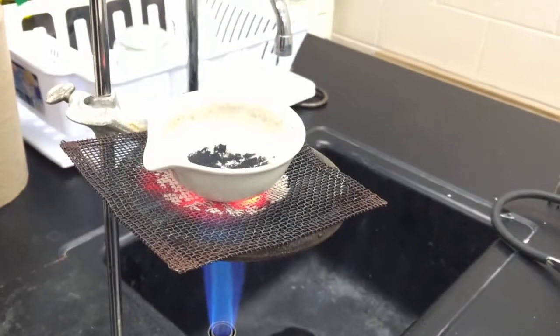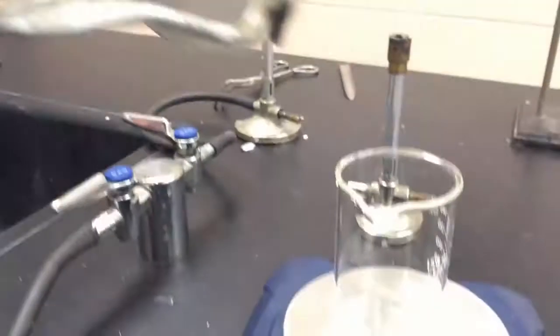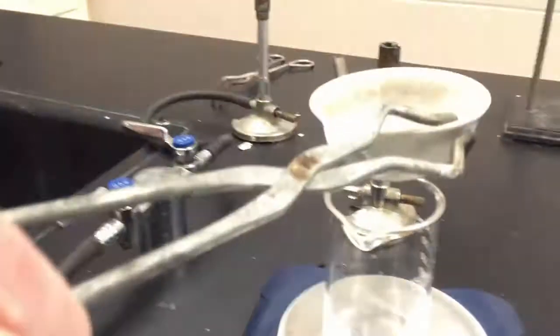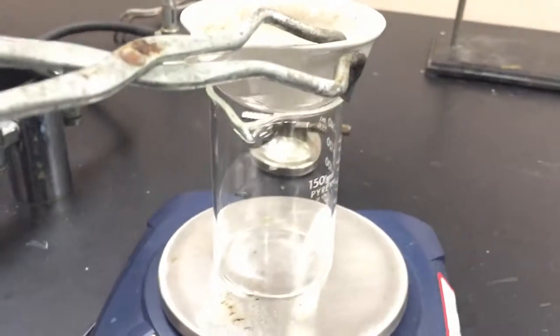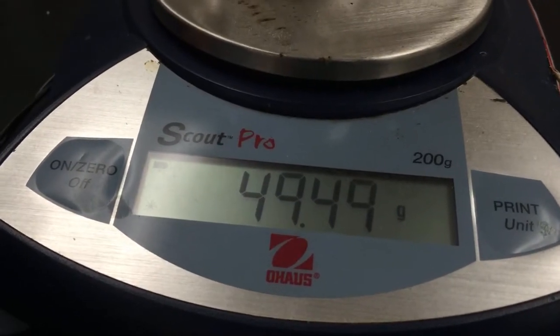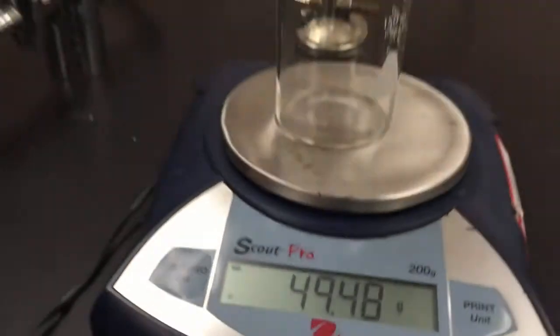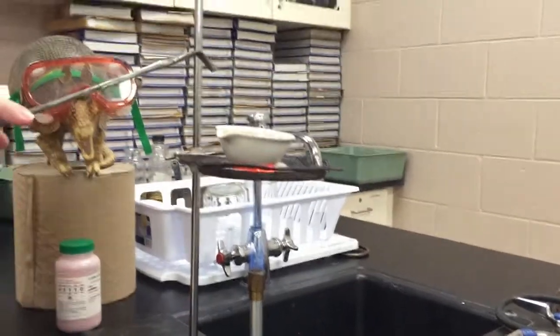All right, let's get a mass and see if we've had any mass changes since it's been heating. The first mass was at 0.42. Then it went down to 0.37. I think it went up a little bit after that, and it is now up to 49.49. So it is heavier than it was to begin with. The only way that could possibly happen is if atoms have been added to the contents of this evaporating dish.